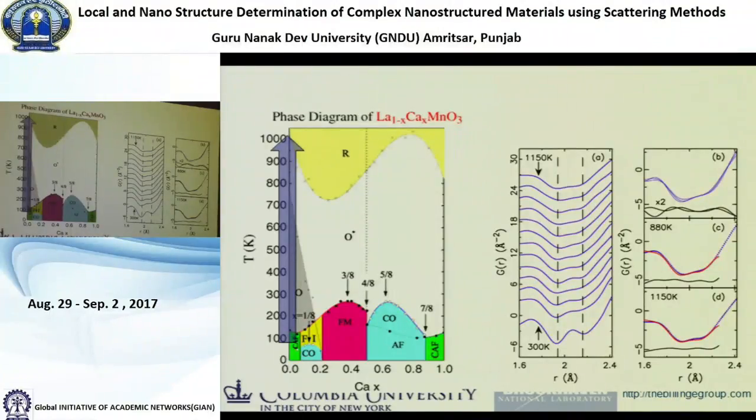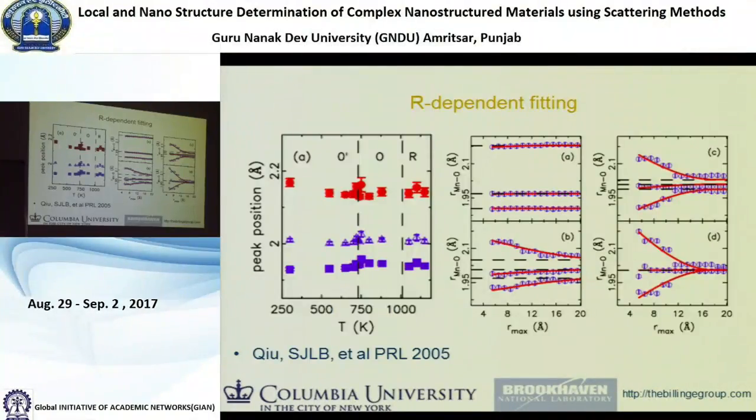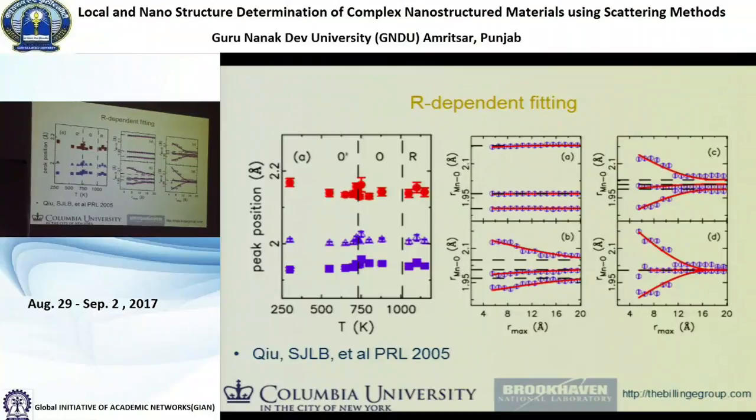So basically what's happening is that you have these Jahn-Teller ions here, but they can take different orientations. So it can be this direction, or that direction. And actually, if it becomes dynamic, it can flip. So my long bond, that. So we can see the crossover actually in the PDF.